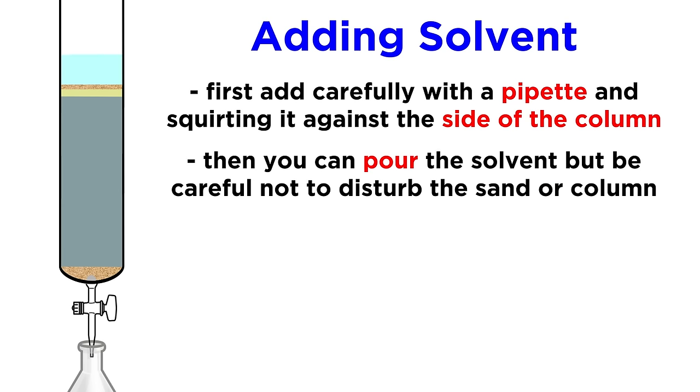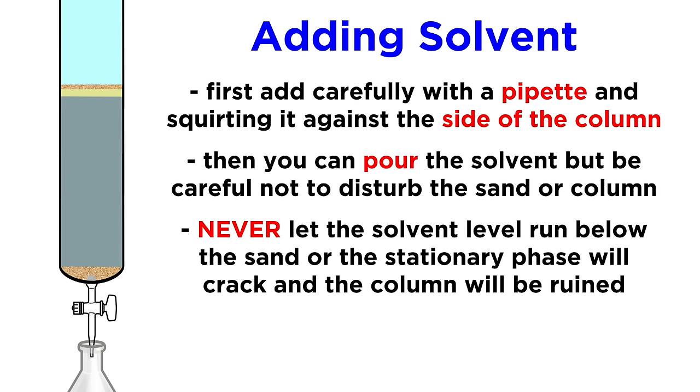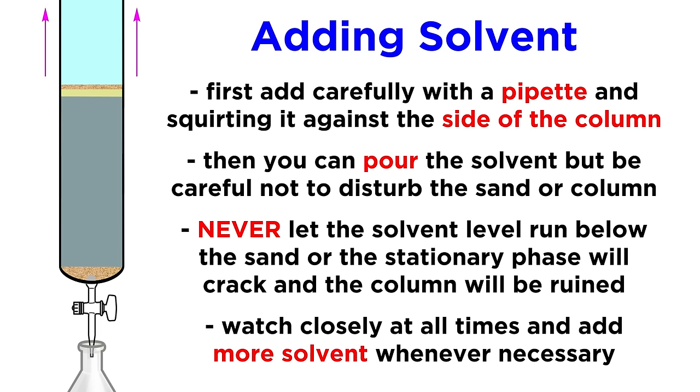At this point you can carefully pour in more solvent from a beaker, just continue to ensure that the sand is not disturbed, and in general, once we begin to run the column, never ever let the solvent level go below the sand, or the stationary phase will dry out and crack. The solvent level should always be well above the sand, so monitor and add more as necessary.